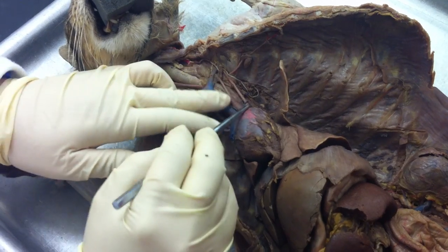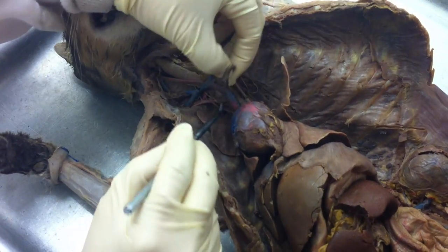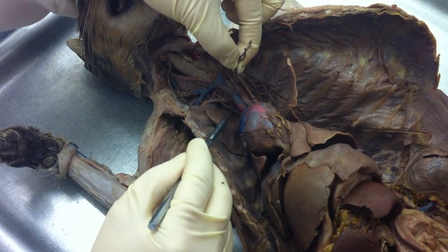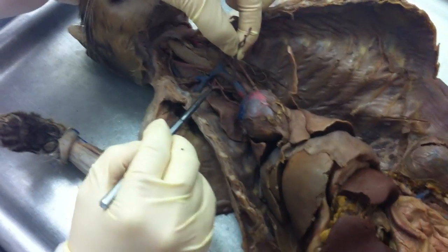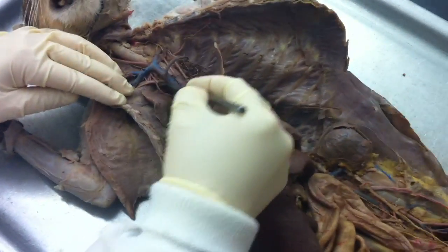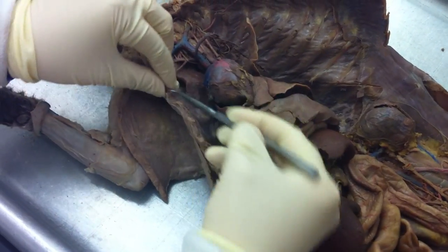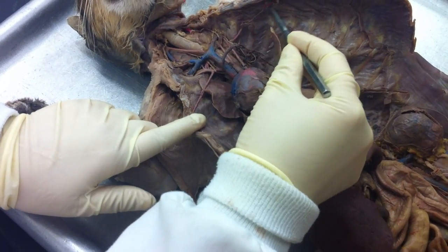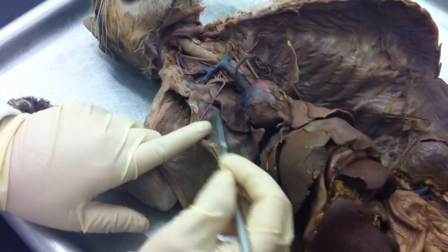And again, it extends from this side. I wish I could get this thing out of the way, but it extends from the brachiocephalic artery all the way to where it starts to split right there. Let me know if you can't see anything. Off of the subclavian, this one's broken. Mammary. That is the internal mammary right there. In fact, on this side, it's still intact. And that makes sense, right?